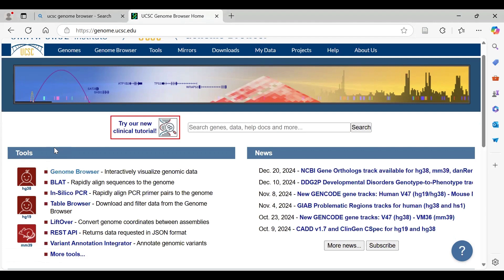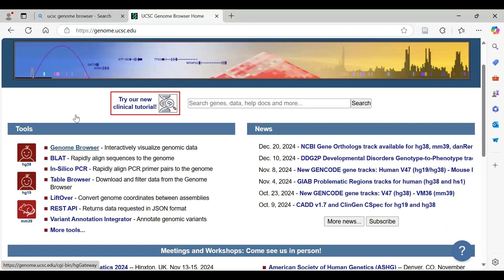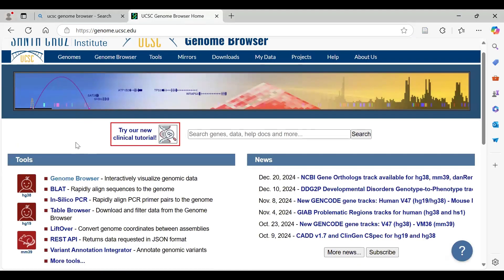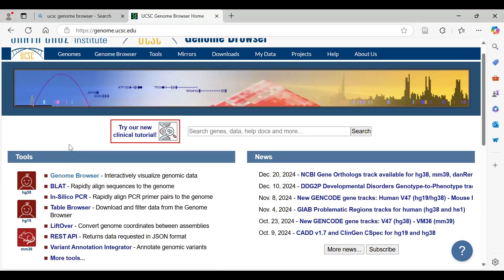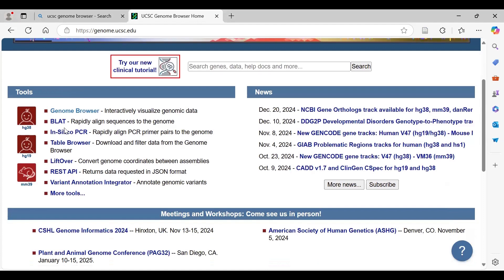A brief introduction of UCSC Genome Browser: this is a tool for visualization and analysis of genomic data. It provides various types of visualization interfaces with which we can explore genomic data, look for annotated features, and also access a vast array of experimental data collaborated with genomic data to get biological interpretations.